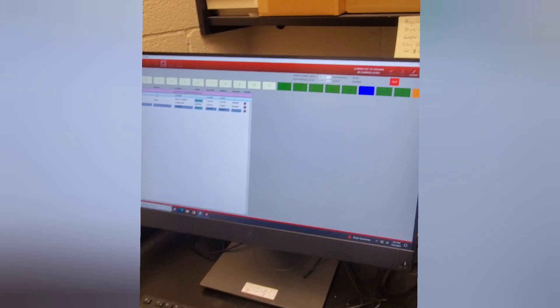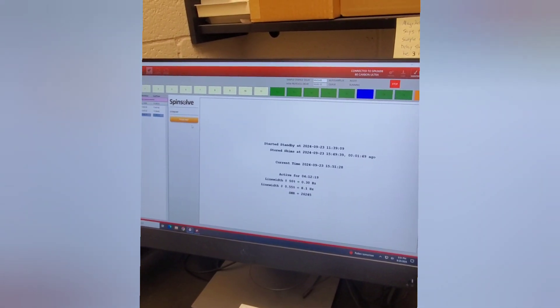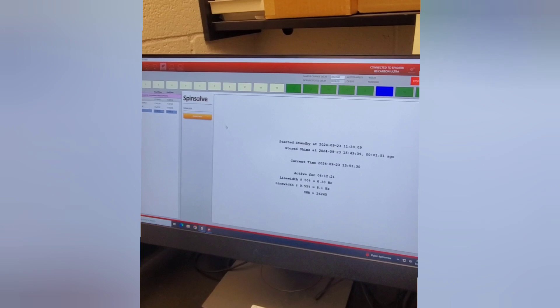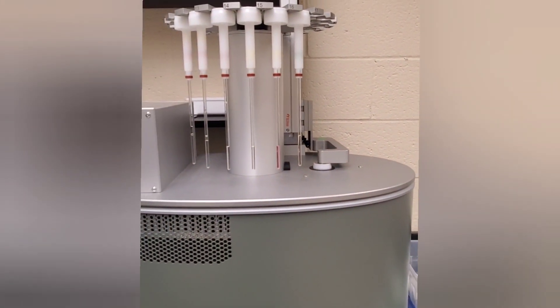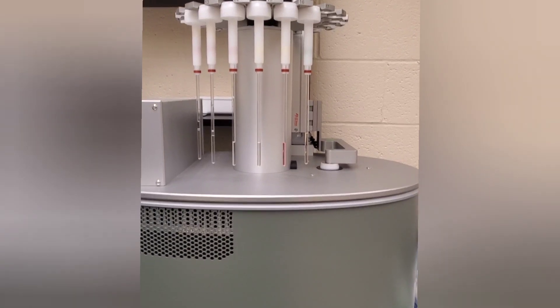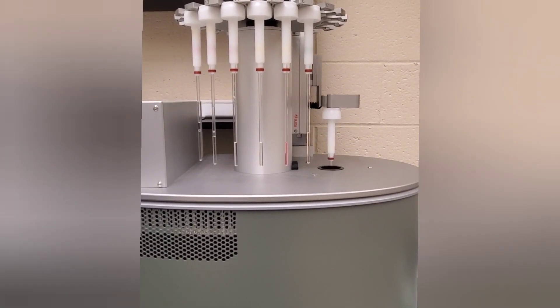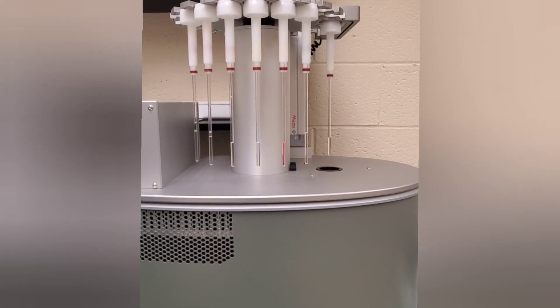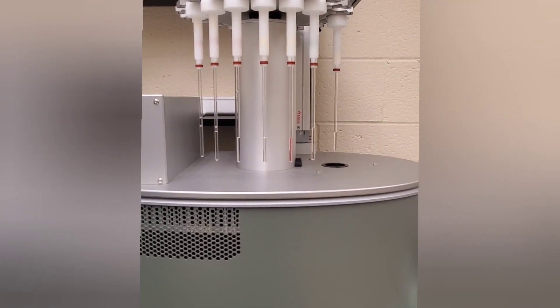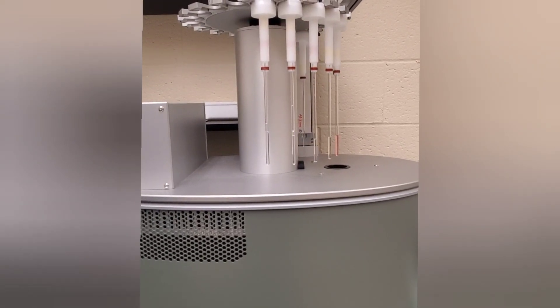When we're ready to start, we click on the reference at the top and ask it to stop. What you'll see happen is that the reference tube will actually come out and our new sample, Lizzie Brew, will come in. The auto sampler will do what it's supposed to do — slot 20 will come out, the auto sampler will move over to slot 17, and insert the sample.